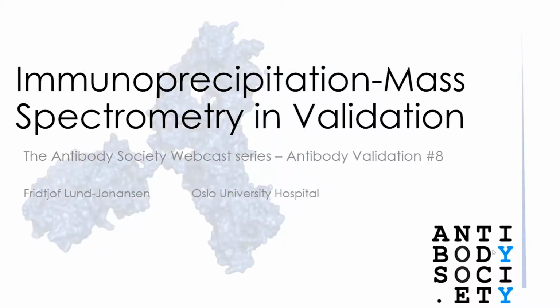Thank you, Simon. In this presentation, I will first go through some of the more commonly used methods to test the performance of antibodies and validate them. And then in the second half, I will explain how antibody array analysis can be combined with immunoprecipitation and mass spectrometry to meet needs for both high throughput and high precision.